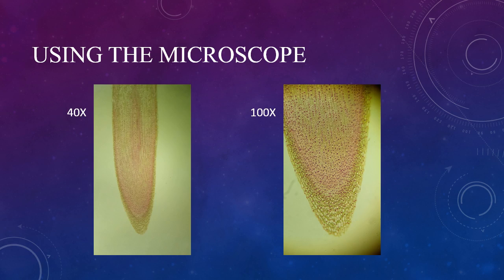At 40x total magnification, I can plainly see the tip of the onion root. At 100x, I can see individual cells, but not a lot of detail yet, so I need more magnification.